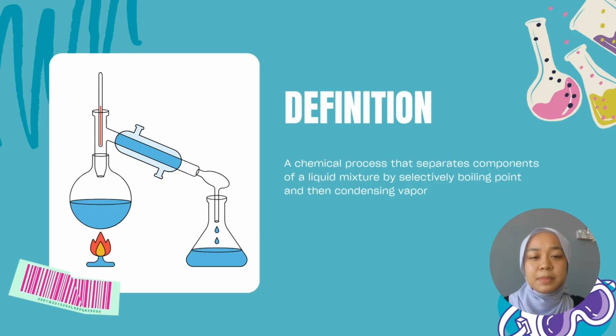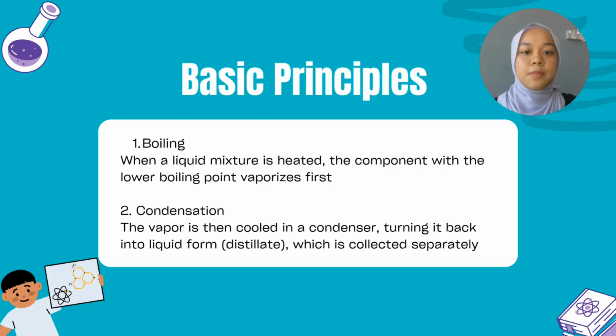So, what is simple distillation? Simple distillation is a chemical process that separates components of a liquid mixture by selectively boiling points and then condensing vapor. So, these two are the basic principles of a simple distillation.